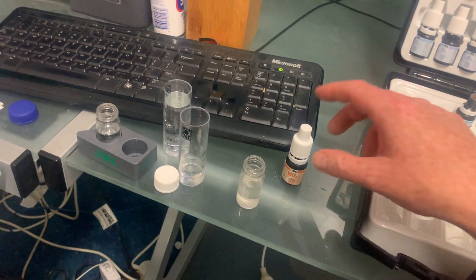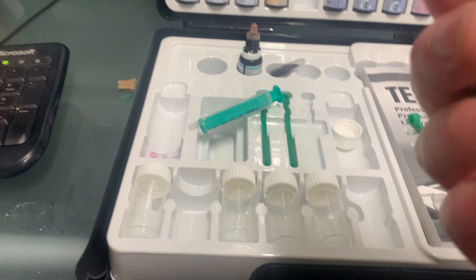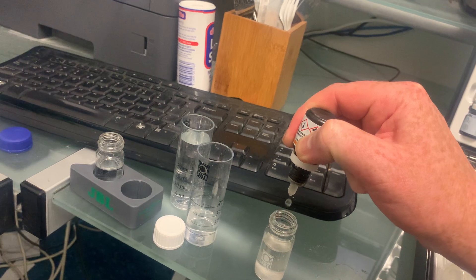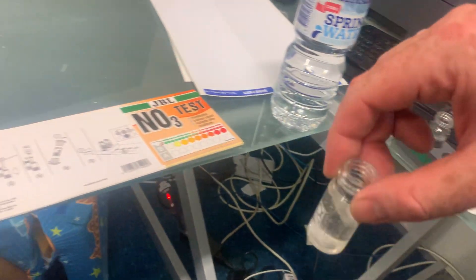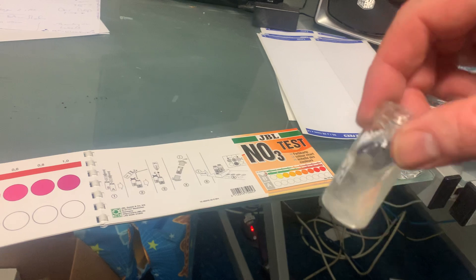Now let's get our nitrate reagent 2. That's going to be 6 drops: 1, 2, 3, 4, 5, 6. Give that a shaky shake, and then you've got to wait 10 minutes.